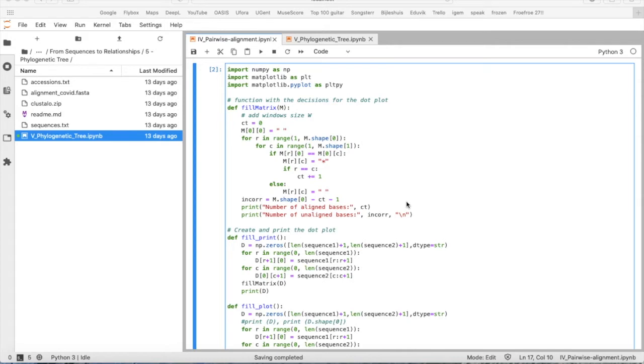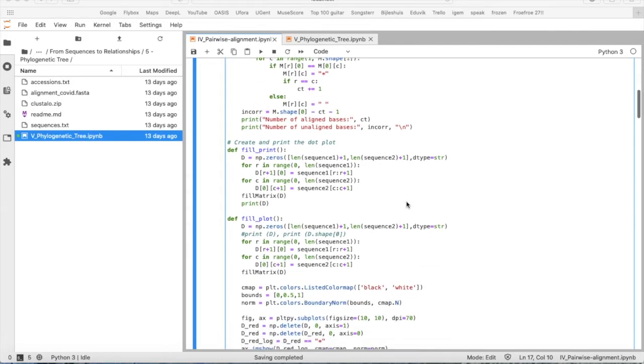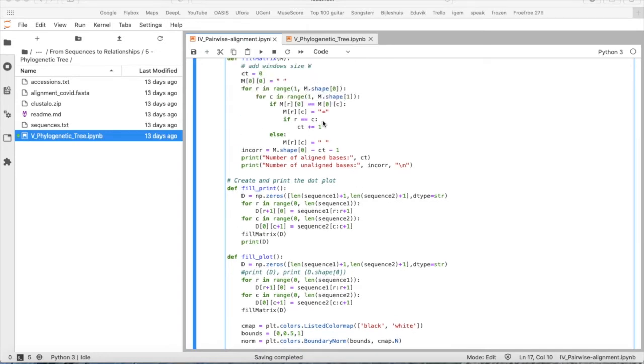So we will make two separate kinds of dot plots. And every kind of dot plot needs another function, of course. First of all, we define the function fill_print. We will just print the dot plots as this dot or an empty space.